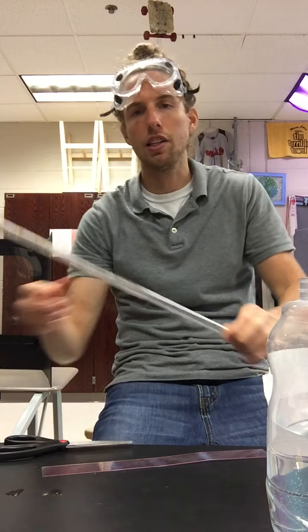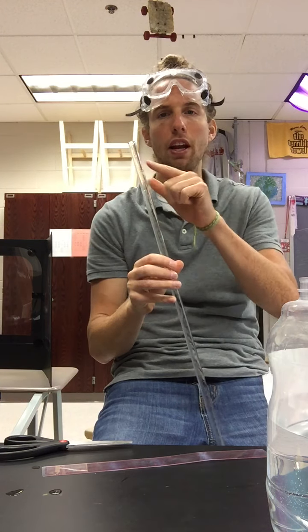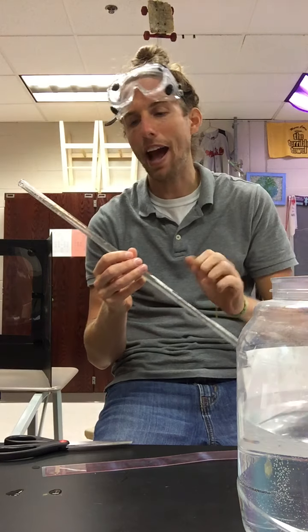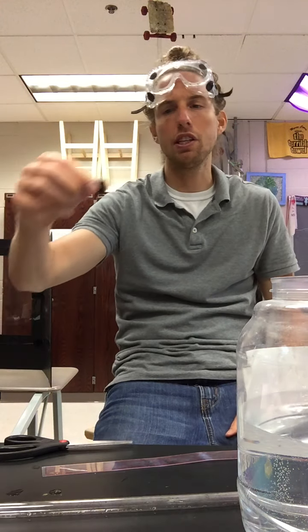But this setup we'll use in a second with this long piece of glass called a eudiometer. The eudiometer is closed at one end. It has an opening on the other end for the stopper. And what we're going to be able to do is collect gas in this device using our water to trap the gas.